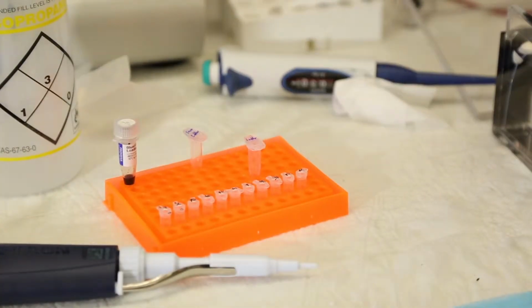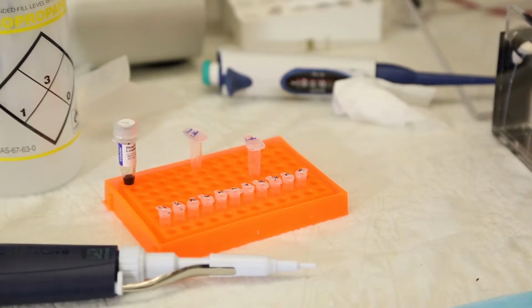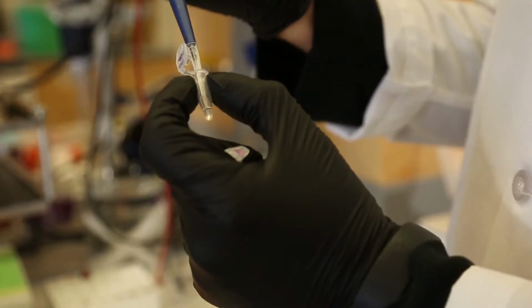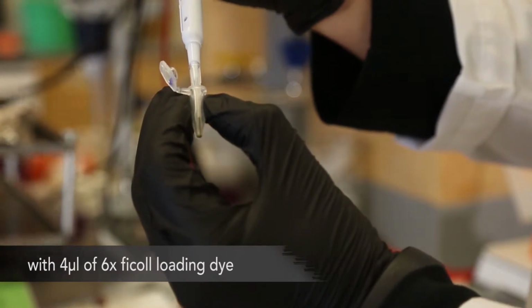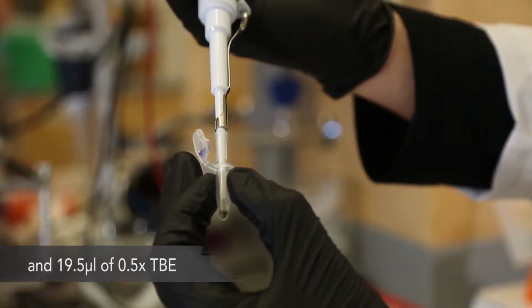To each of the 12 microliter samples, containing 2 microliters of biotin and 10 microliters of the construct streptavidin mixture, add 2 microliters of 6x Ficoll loading dye. We recommend running a ladder alongside the on-rate samples to aid in verification of the looped and unlooped bands. To prepare the ladder, mix the following: half a microliter of 1 kb extension ladder, 4 microliters of 6x Ficoll loading dye, and 19.5 microliters of 0.5x TBE.